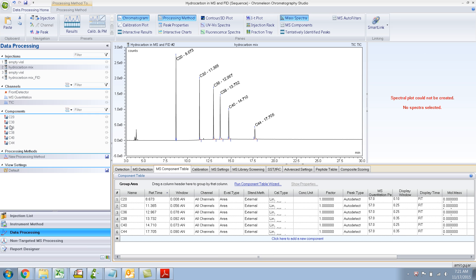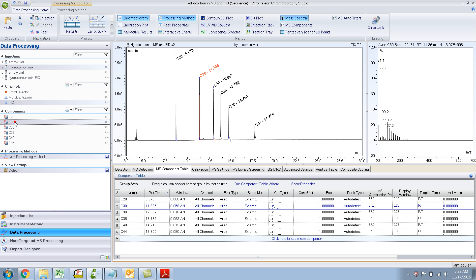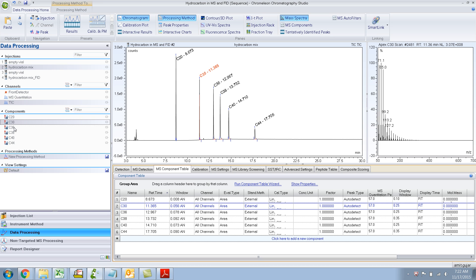If you look closely, it shows a picture of a molecule. And right beside that you will see a red exclamation mark right now. So let's hover around one of them. If I click on this and hover around: 'Component detected, confirmation failed because the reference peak could not be found.' And 'Component not found in quantitation trace.'